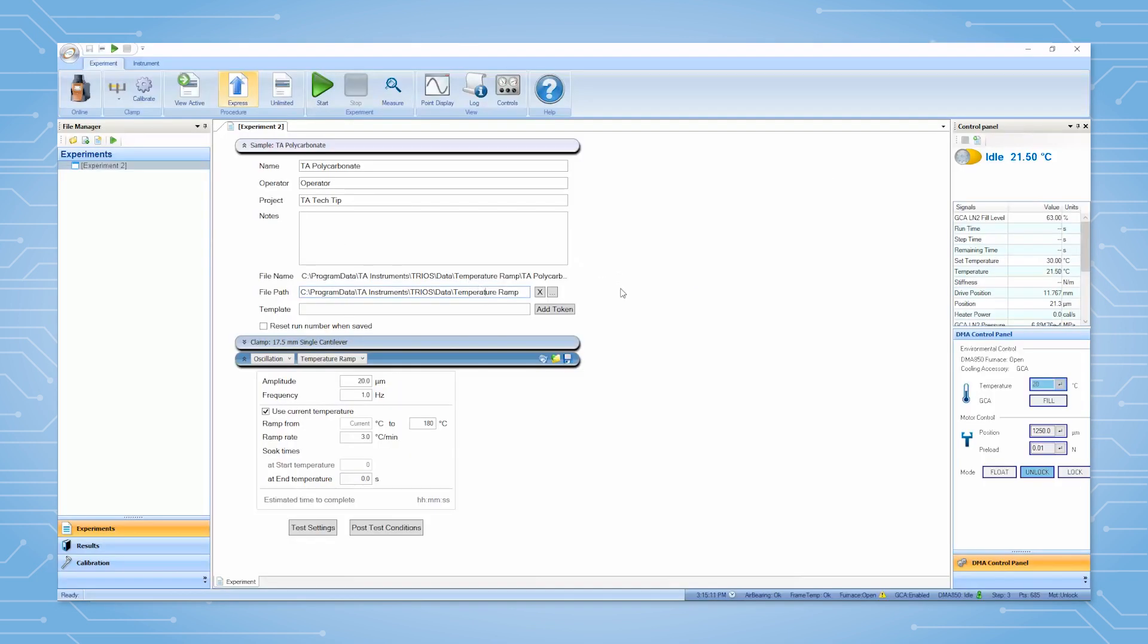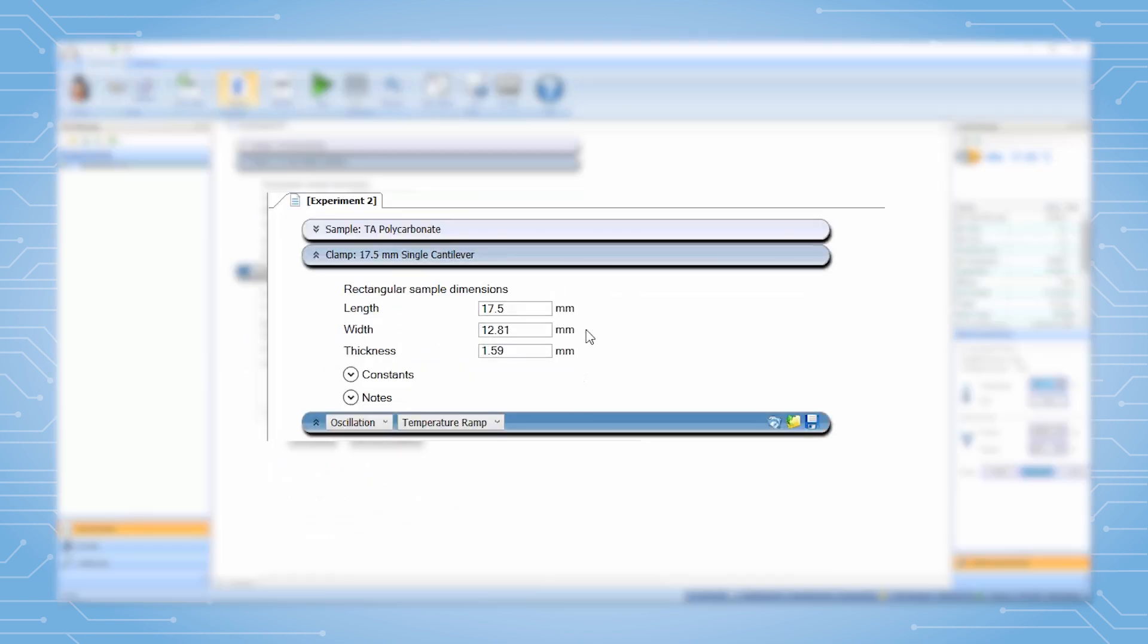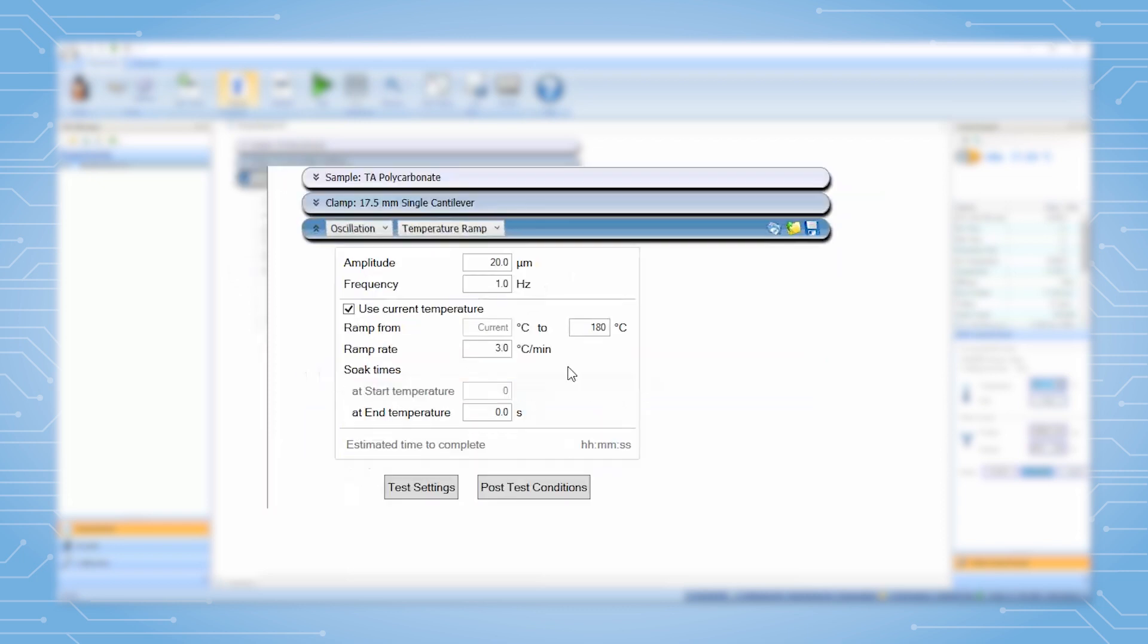Next select clamp and input the relevant measurements used to calculate the strain and stress values when setting up the experiment. The final section is experimental parameters. Select oscillation temperature ramp.